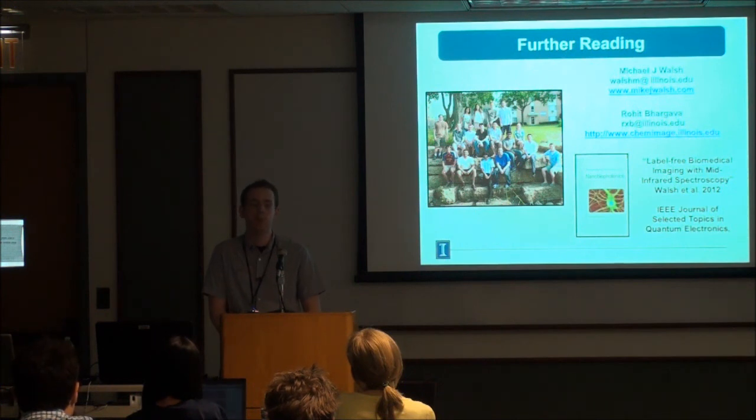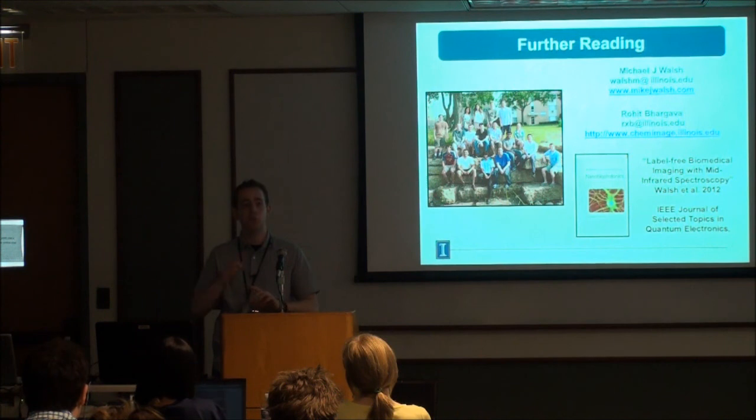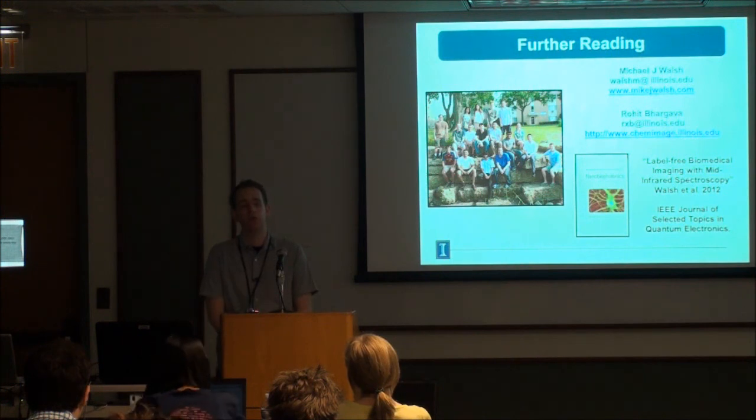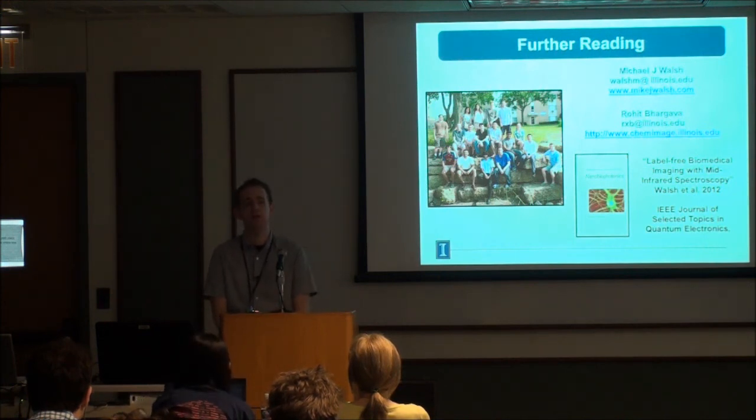I think my feeling on this at the moment is that you're not necessarily going to replace staining, certainly in the near future. The pathologists I work with are really excited about this more for helping them with things that current methods fail on. I literally have a pile of projects, sarcomas, for example. It's very difficult to tell the cell type of origin with sarcomas. There just aren't the stains available. Types of lymphoma, thyroid cancer. So this type of thing is very useful where they simply don't have approaches now. I think that's where the niche is, with both IR and Raman.